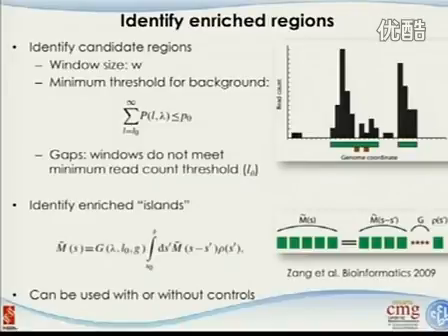But once you look at different bins together, this one is okay, but there's a gap. And suddenly there's another bin that is okay, and another gap, and 2 bins are okay. So even though this is an enriched region, you can potentially see this, right? Because in some parts you just didn't sample enough, and in some parts you just didn't detect the signals.